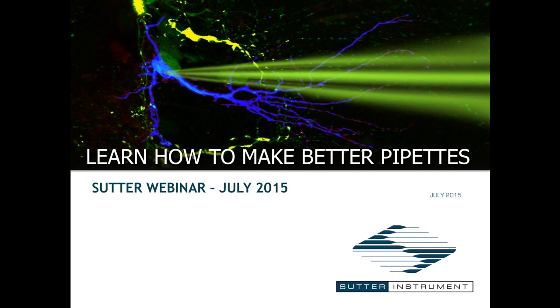The only difference on the P2000 is if you use quartz, then you will also need a pull for patch pipettes. So even for relatively short pipettes, you will need to dial in a pull. And Jan, I think you've developed a nice catalog of parameter settings to help people get started with, depending on what their application is and what glasses they're using. It's something that we hope to create for the P2000 eventually, but it functions a little differently, so we're still working on that. Thank you both.